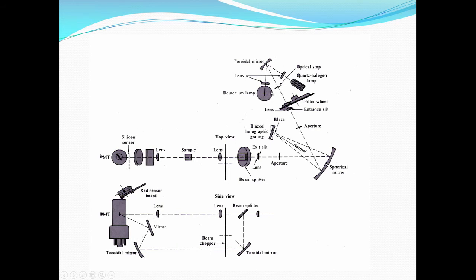Normally the mirrors and lenses are never to be touched with our fingers. That is one of the requirements, and here you can see in this figure how many pieces there are, lenses, mirrors and all other things.